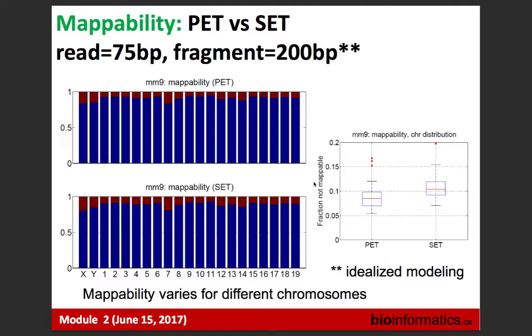So you're probably going to get a better understanding as you go through the module. All alignments are done single-ended, so the pairing is done after the fact. BWA's seed length is 32 by default, with two mismatches, although Misha is showing you that there are other options, such as a smaller read length. The problem is that once you get past 100 base pairs, what's not mappable is kilobases in length. So going to 200 or 300 or 400 or 500 isn't going to help resolve those. You get to a plateau, and the incremental increase in mappability is very small as you get longer and longer.